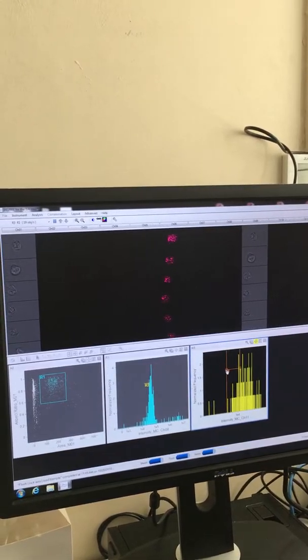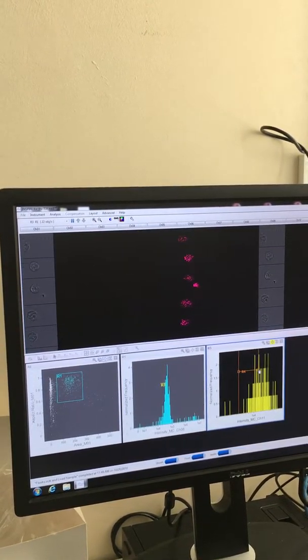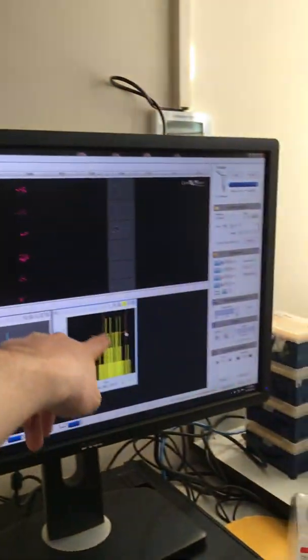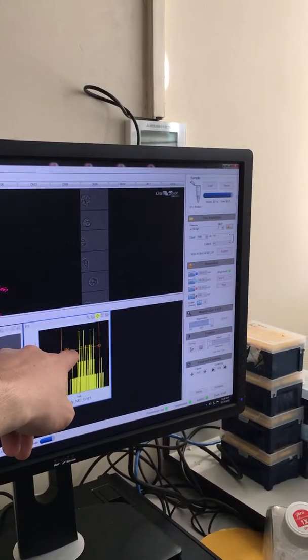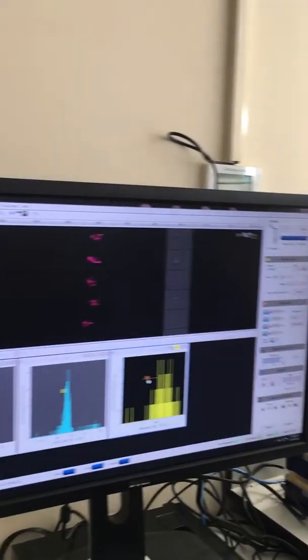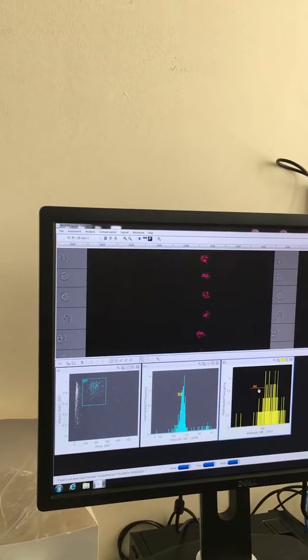The box. Maybe like this. Yeah. You shouldn't move this side, remember, because that's set from the isotype. You want to move this side, so put it back to where it was, which was like, I don't know where it was, but you don't want to move that side. You want to move this one to include all your positive events, but you don't want to move this one because it's set by your isotype. It's not coming with me.